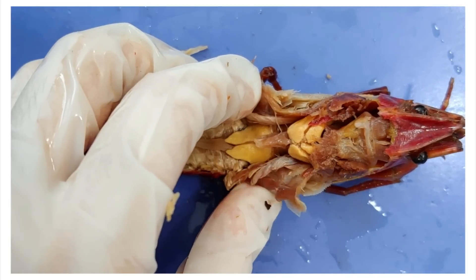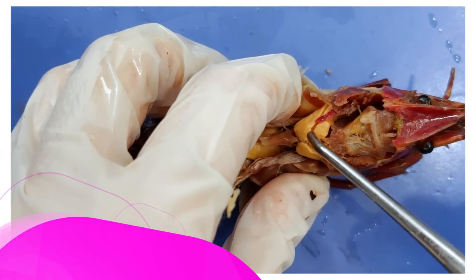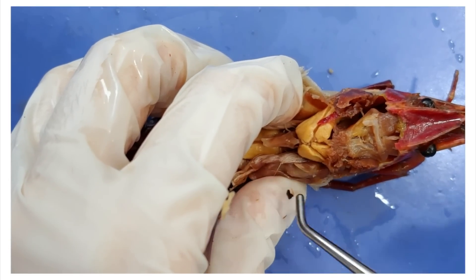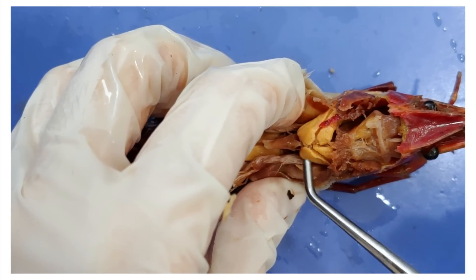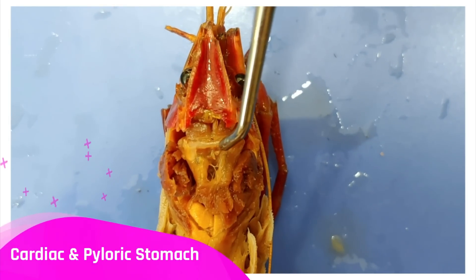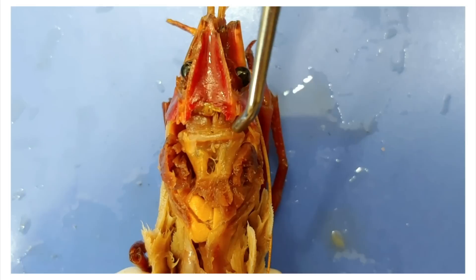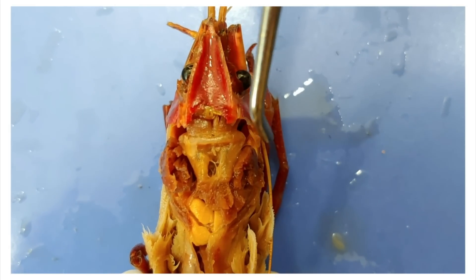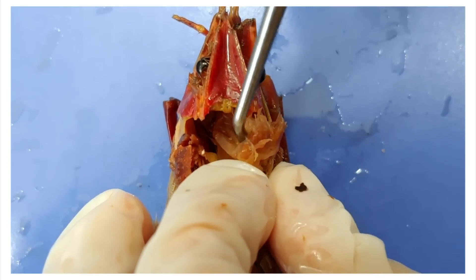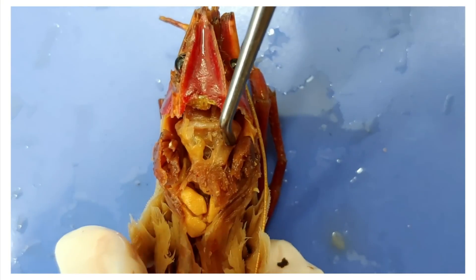Moving further up, these structures here are the digestive glands, which produce digestive enzymes and also store glucose. Up here is the cardiac and pyloric stomach, which are great partners in crime: the pyloric stomach does chemical digestion, while the cardiac stomach does mechanical digestion. The cardiac stomach is the thinner-walled structure here, and the pyloric stomach is the thicker-walled one sitting above the cardiac stomach.